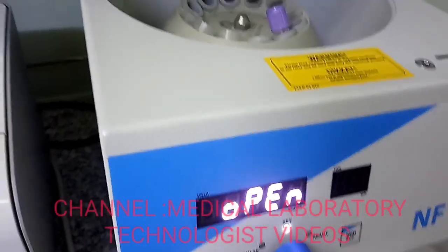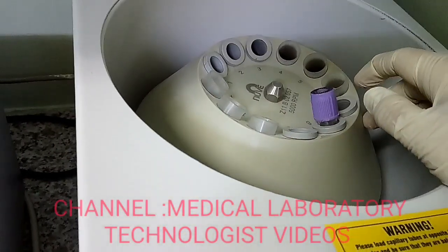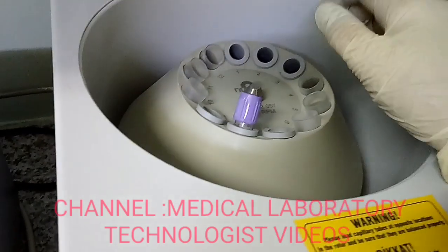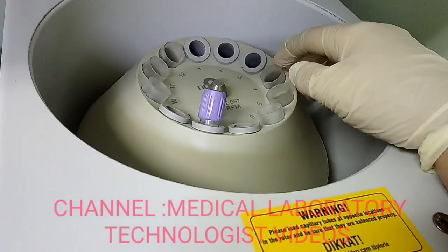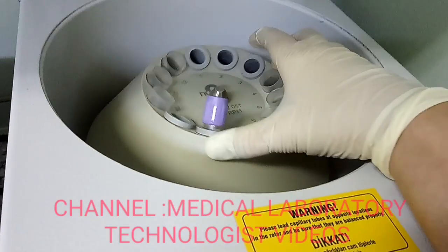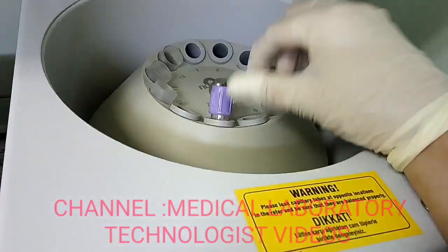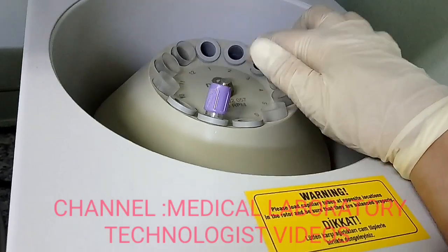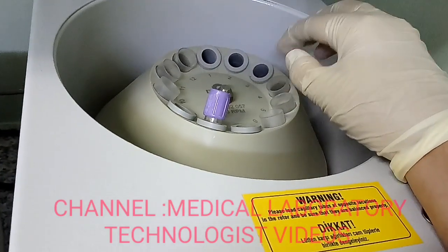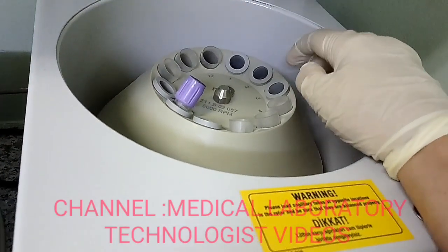One of the most important and beneficial points of this centrifuge is the drive system. Other centrifuges have a brush-type inductive drive inside, which over the years or under heavy workload can become damaged, causing the rotor to fail and the centrifuge to stop processing. This centrifuge uses a brushless inductive drive, which gives you long-term durability — you can use it for a long time even under heavy workload.